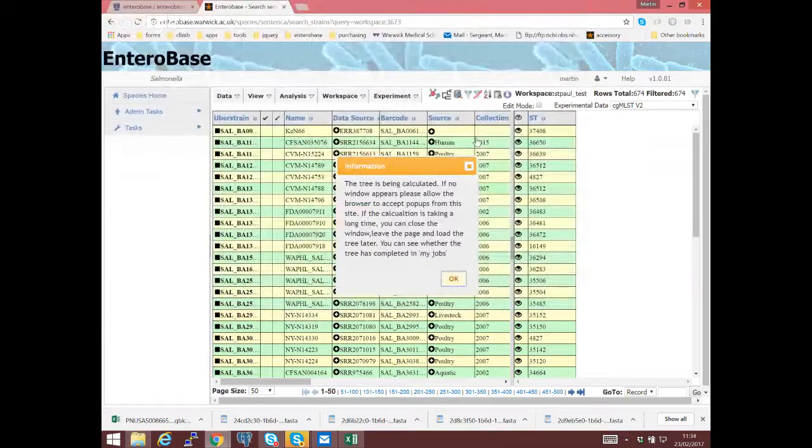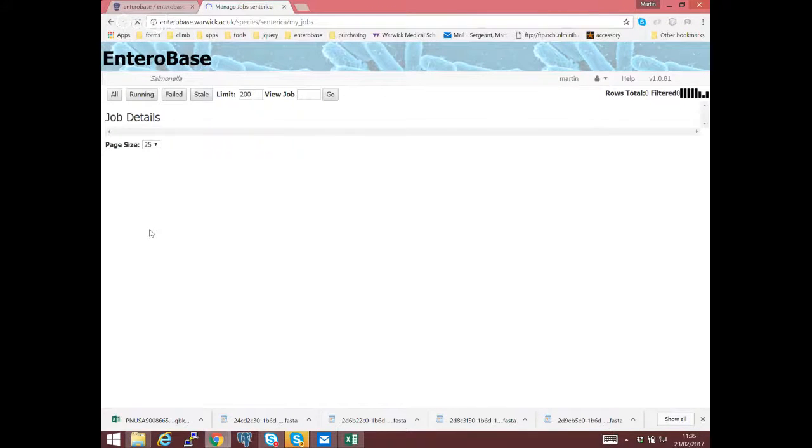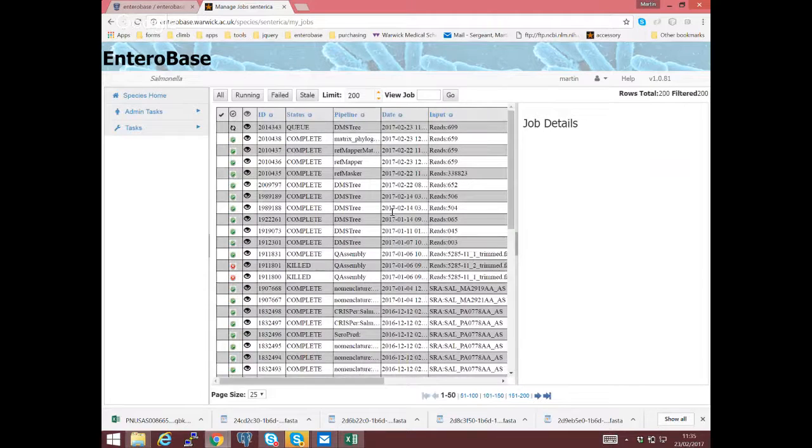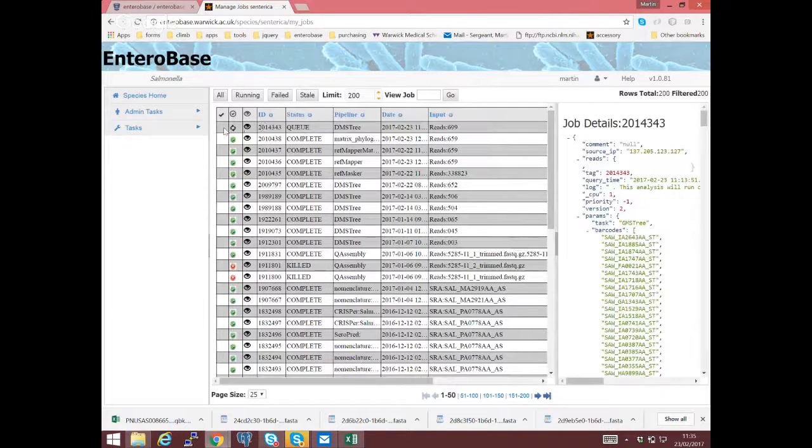So I'll close the window, and I will go in tasks. I will go to show my jobs. Okay, and we can see at the top here that this job is running.